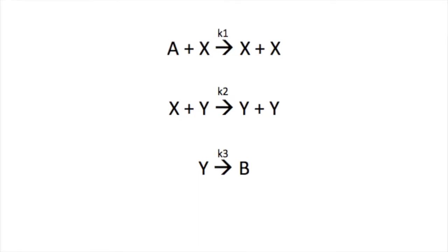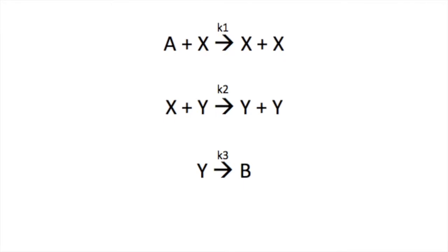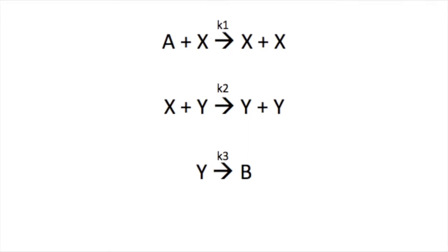The first reaction shows the slow buildup of the yellow iodine solution, X. Once enough X builds up, the second reaction quickly takes place and the solution turns to the blue starch complex, Y. Since Y is a reactant and a product, this is an autocatalytic reaction. The blue starch complex remains until there is no X left to continue the reaction. The cycle starts over and more solution X builds up until the second reaction proceeds again.